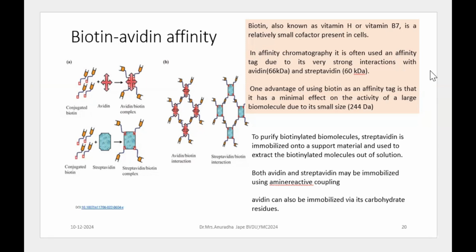At the same time, it should have a group of binding sites with which it will anchor onto the matrix also. So the most common such groups are, say, NH2 amine or carboxyl group, SH group, phenolic and alcoholic OH groups, right? They are involved in the process.